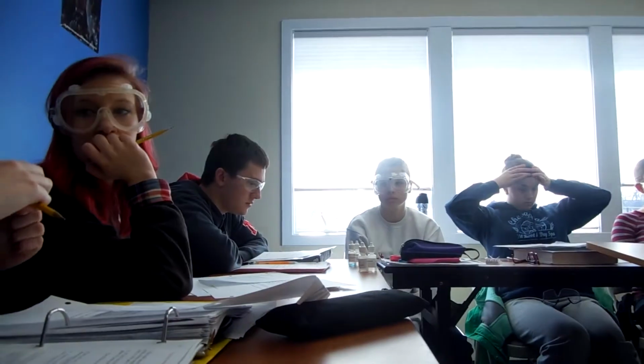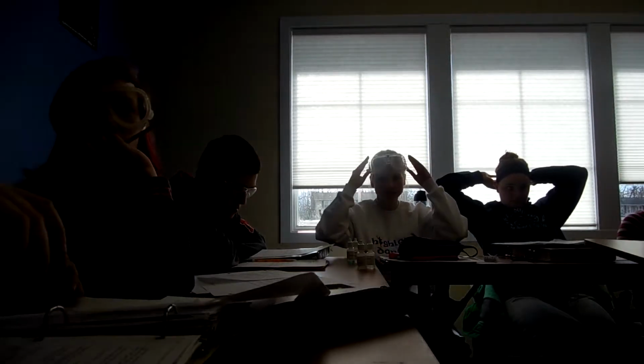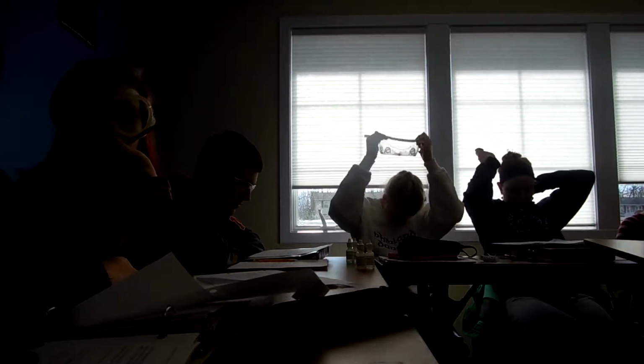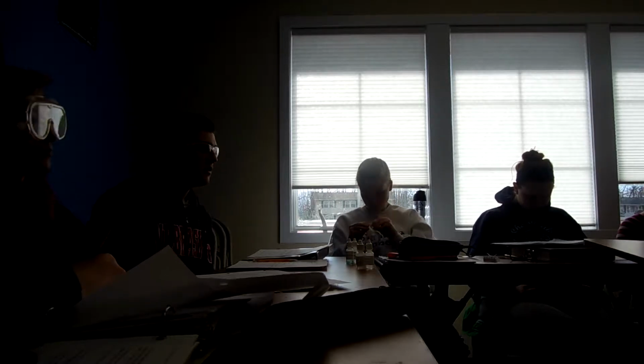I'm just going to stop walking with the camera. Also, this first one that we did, where we weren't sure about calcium hydroxide because it's slightly soluble. Now, if we look at the first one, can you see that it's a bit cloudy? So we see just a little precipitate. And with the blue, you can see just a little bit of stringy. What's the orange? That's the one that we had the failure with. I don't think that we should have seen a precipitate, so we tried it 3 times.